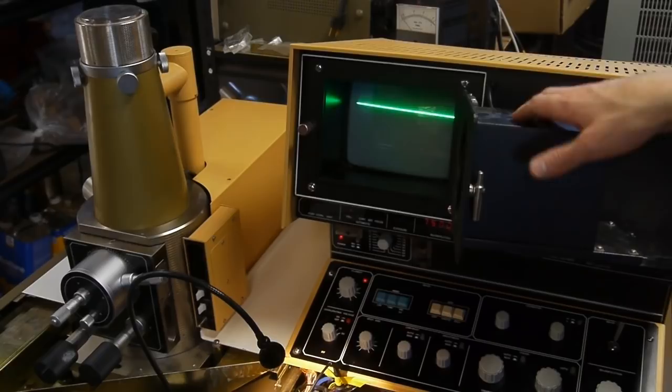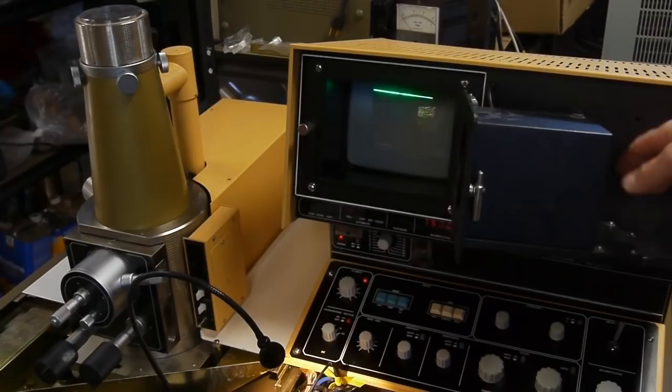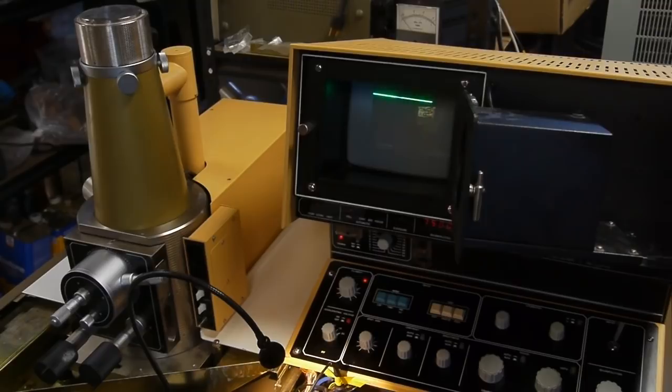And then it also has a super slow rate that's meant for use with the camera. The full scan takes about 60 seconds. And even modern cutting edge scanning electron microscopes still require this same amount of time to collect a high quality image, just because the problem is actually physically based. It's just the number of electrons that we're trying to capture.